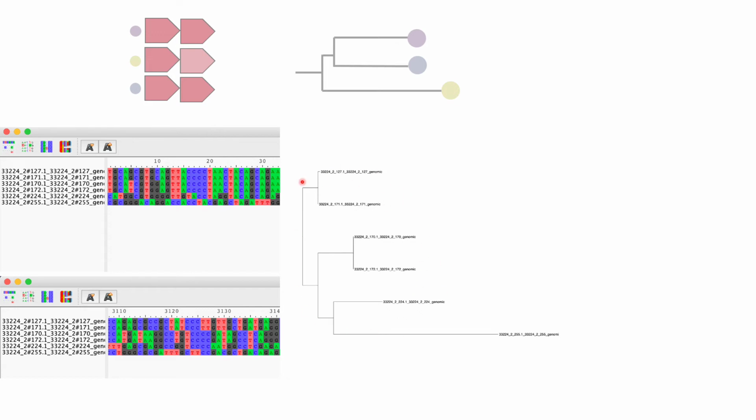And you can see what I've already alluded to with these sequence similarities: our top 2 genomes are really closely related, and they're a little bit distant from these middle 2 genomes, which are more closely related by what's called a recent common ancestor to the bottom 2 genomes. But these bottom 2 genomes are even more different from each other compared to the top 2 sets. So these branch lengths and this tree topology are hopefully reminding you of the schematic that I showed earlier.